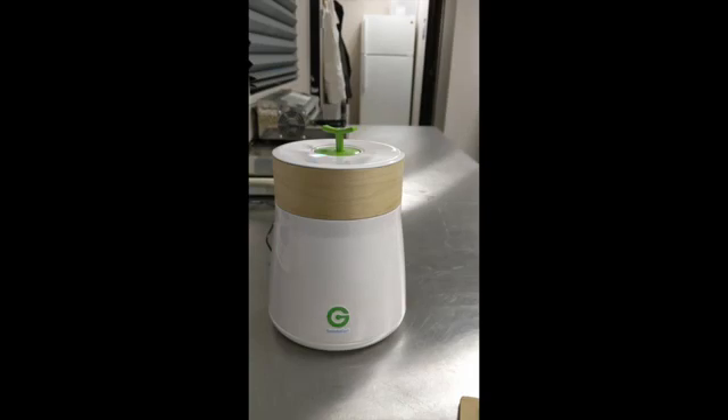So with this device, you basically spend five or six minutes and you can get a very, very accurate number. We're really happy with the results we've been getting, and they tend to compare very closely to what the laboratories are giving us.